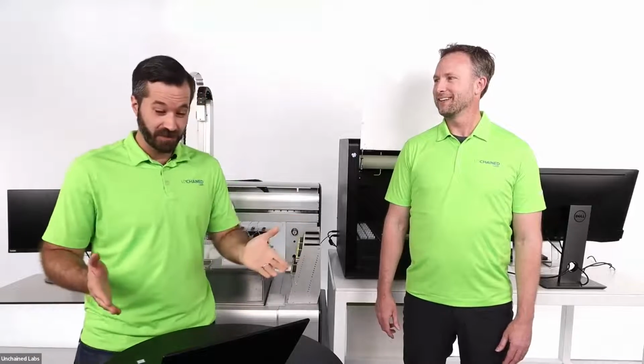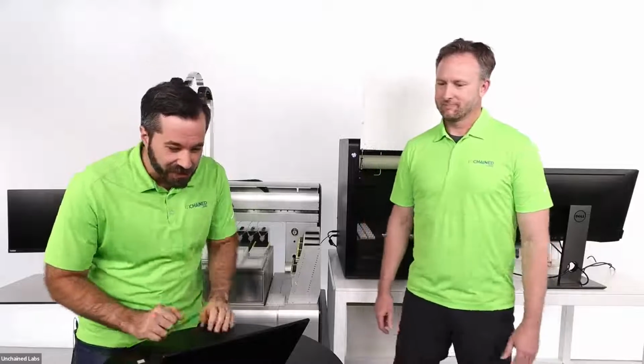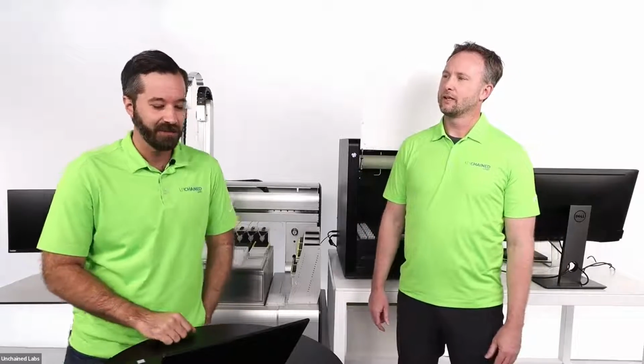Cool, so thanks for that demo. That went really well, I think, Del. And so it looks like we've got a bunch of questions that have come in through the chat. So you ready to get started on the Q&A? I am, thank you, Ross. All right, fantastic. So first question is, do I need an air hookup to run these?